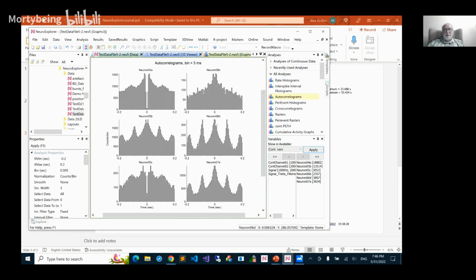So we have a spike at time 0, and it's very probable there will be another spike within a small period of time. Then the probability goes down, and then it goes up again. But this time it's a huge peak.